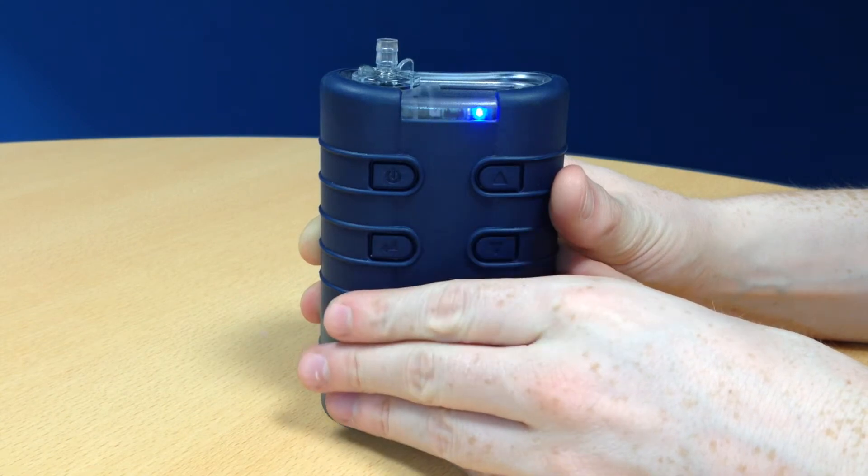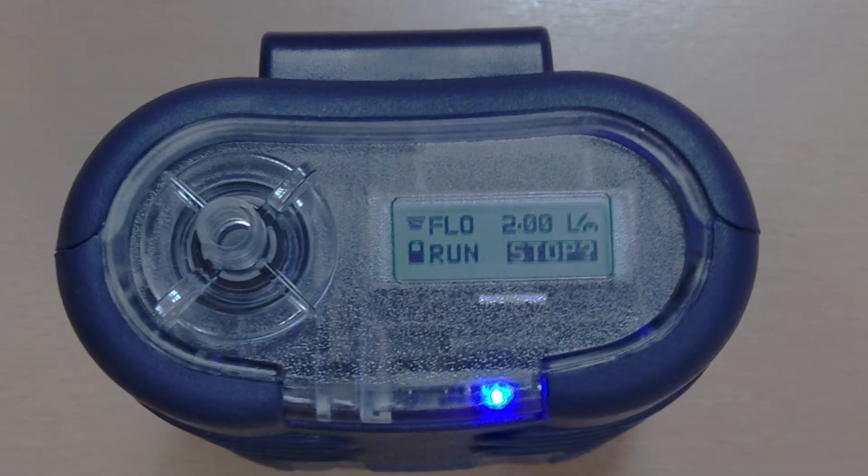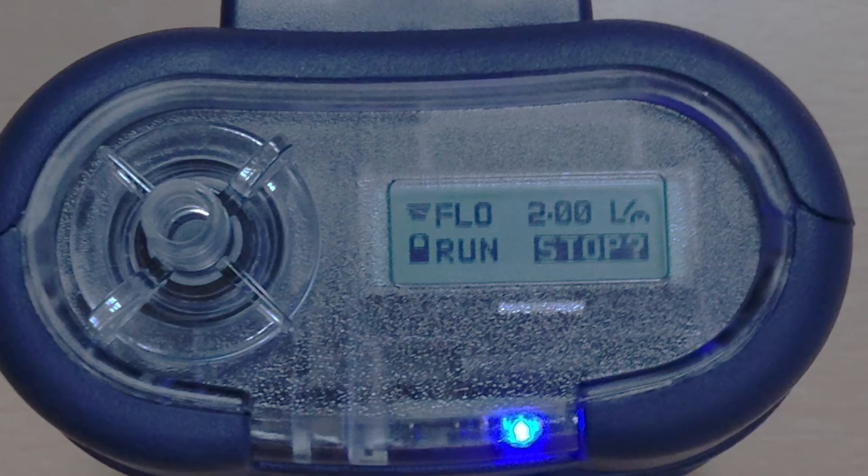To fully lock your Tough Pump, you must first have the Tough Pump partially locked and in run mode. You can then press the power button three times in quick succession again, which will fully lock the Tough Pump. A closed padlock will then appear on the display.